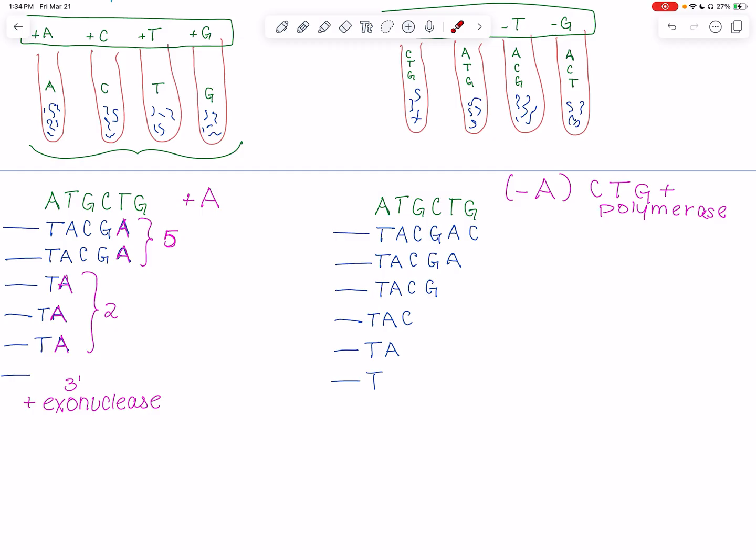So we're going to end up not being able to add an adenine where there ought to be one because of the fact that there isn't an available adenine in our tube. And so, if we are looking over here at our sequences, we can imagine that we are going to have, and I know we would maybe have this a little bit longer, so I'm going to just say we don't know what this next nucleotide is here, so we'll just say this sequence will be a length longer.